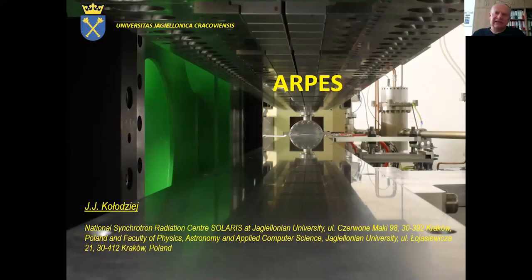So let's start then. We'll be talking today about the ARPES technique. ARPES is an acronym which you read as angle resolved photoelectron spectroscopy. Sometimes it's alternatively called photoemission spectroscopy. You can meet both names. Both are okay.